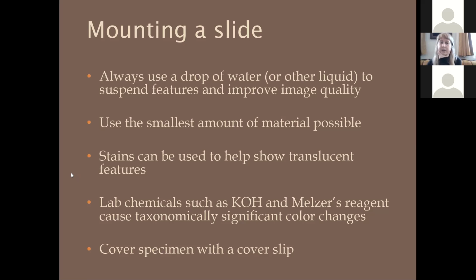Just a quick note about using potassium hydroxide. Potassium hydroxide is caustic. It can kind of burn your skin, so be careful with it. It can do things like clearing out material that isn't fungal related, so it can make your slide cleaner. It also can do things to the cells of the mushroom that are taxonomically significant.